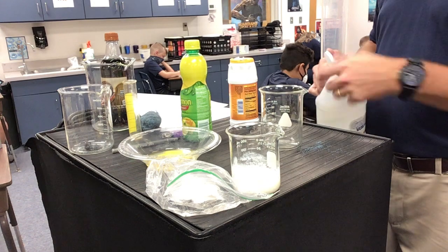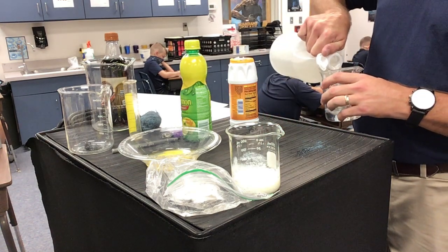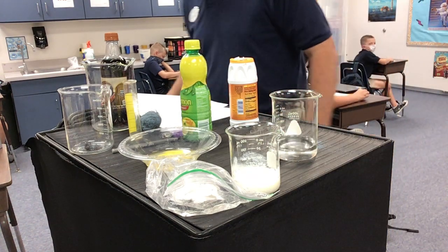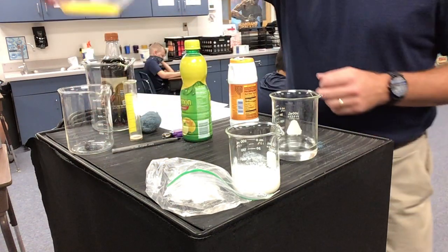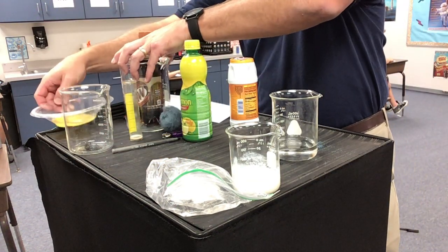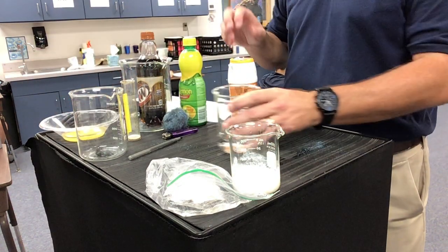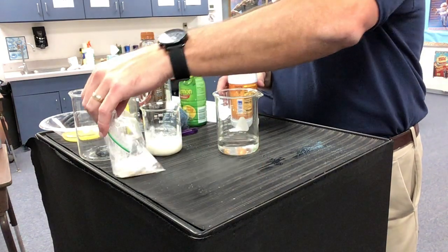Our next one. Go back to our vinegar. I'm going to add some stuff to it. All right.